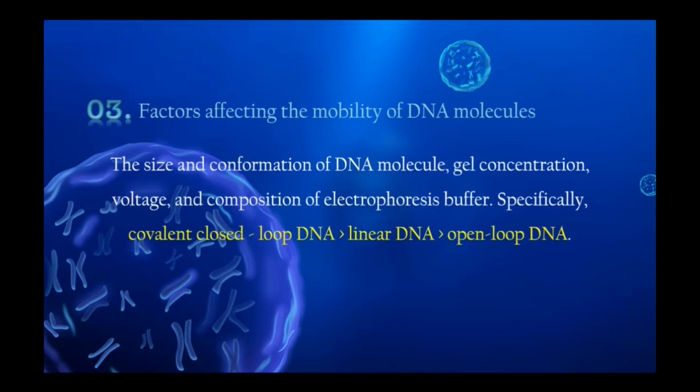And thirdly, factors affecting the mobility of DNA molecules: the size and conformation of the DNA molecule, gel concentration, voltage, and composition of the electrophoresis buffer. Specifically, covalently closed-loop DNA will have higher mobility than linear DNA, and linear DNA will have higher mobility than open-loop DNA.